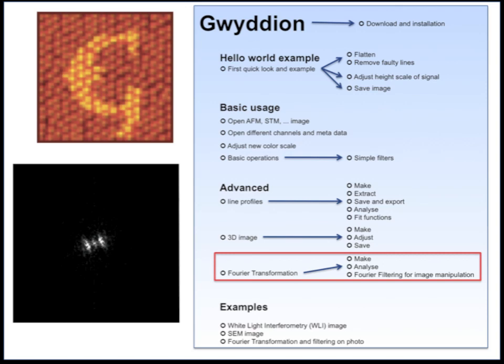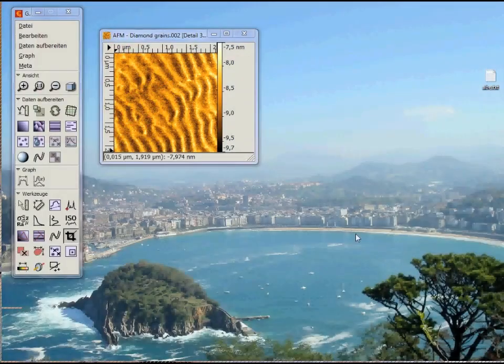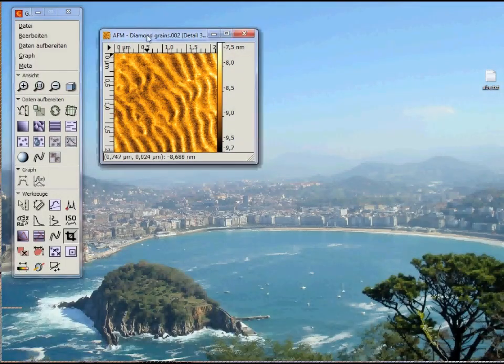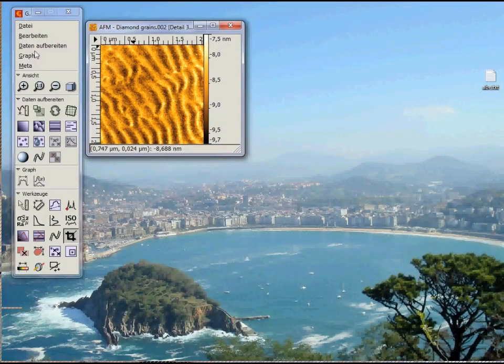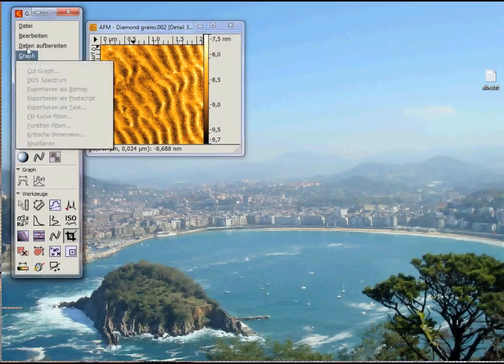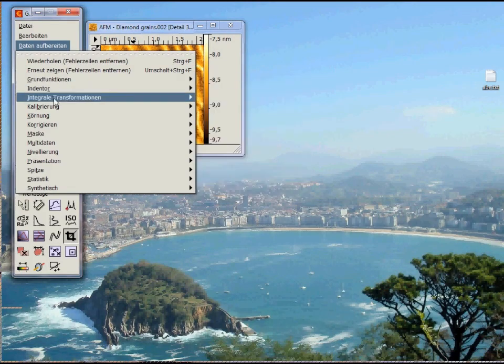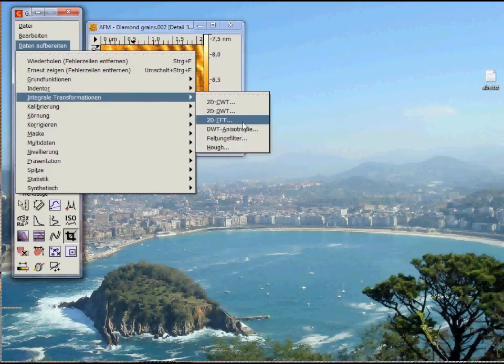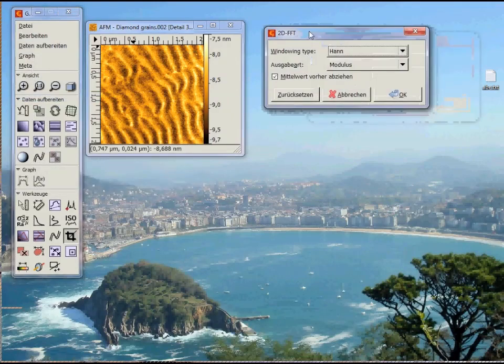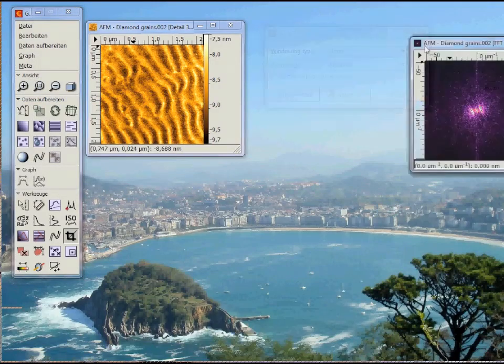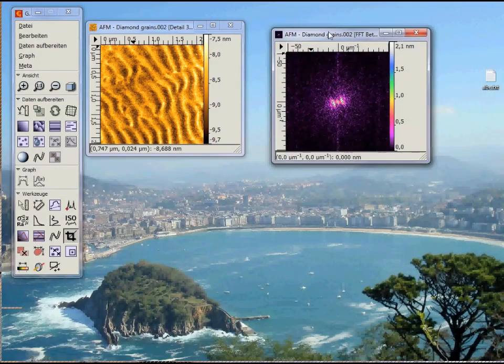Now let's perform fast Fourier transformation which is abbreviated with FFT. To do this, click on Data Processing, Integral Transformations, 2D Fast Fourier Transformation. Click OK and here is our transform.